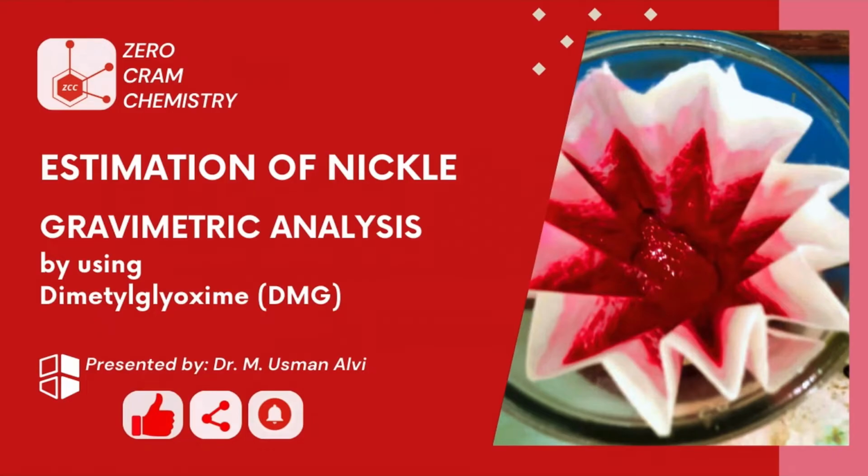So today's lecture is about estimation of nickel by gravimetric analysis, and we are using dimethyl glyoxime or DMG as an organic reagent.